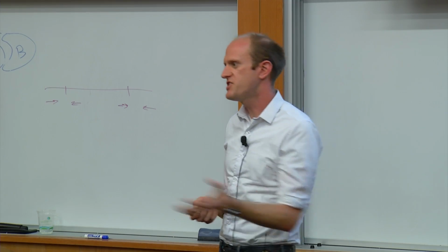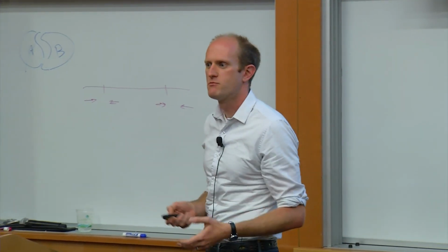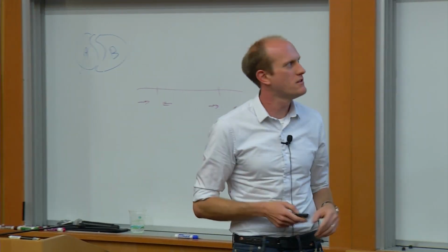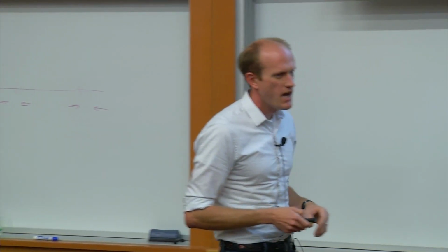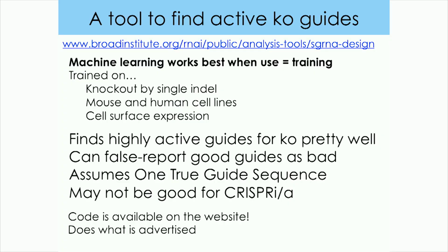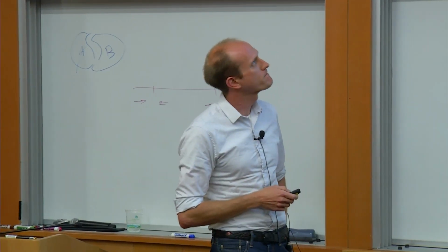If I get a C at this position, -2, right? These are just magic numbers. They're on no scale. But this is actually where the code available on the website is. The program lists all of these magic numbers, and so if you were to retrain on something else, you could easily just go in and plug your numbers into their script and run it.